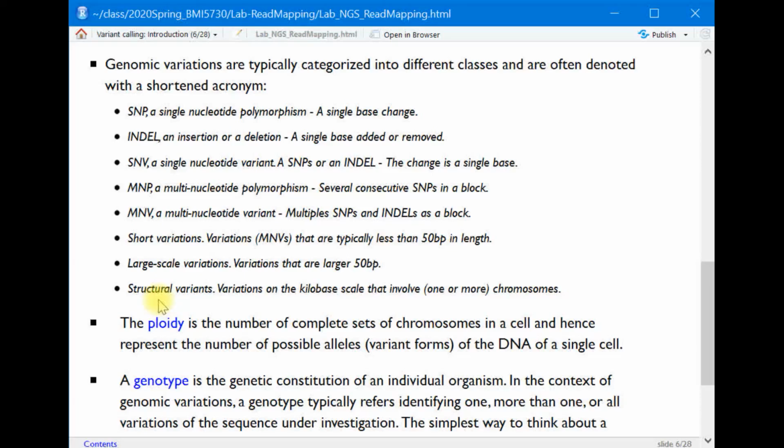As a rule, SNPs are the most reliably detectable variants from the data, and in contrast, very short MNVs are the most difficult to detect. These include insertions and deletions. For example, a deletion followed by another variation can often be better aligned in alternate positions in the genome, and that can fool the variant callers.